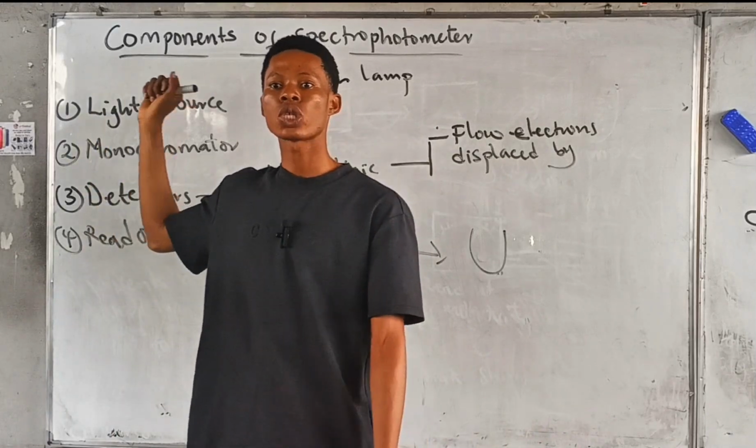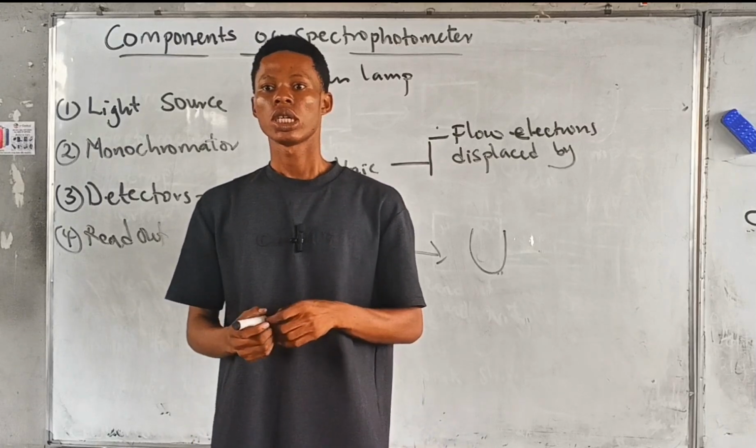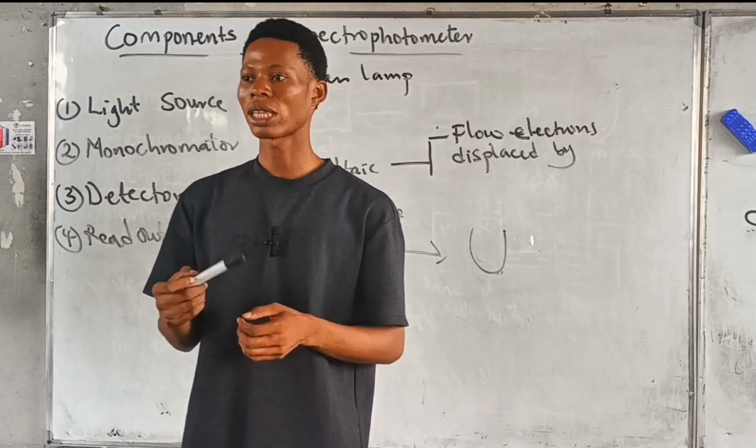Also, it is used in the study of enzyme catalyzed reactions.